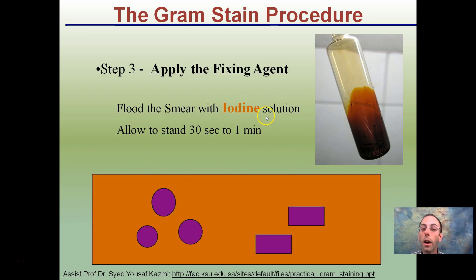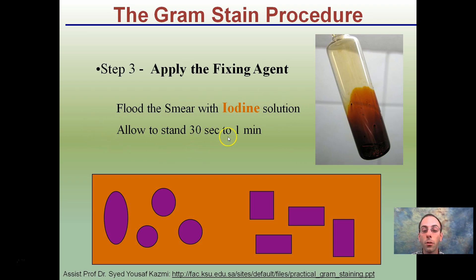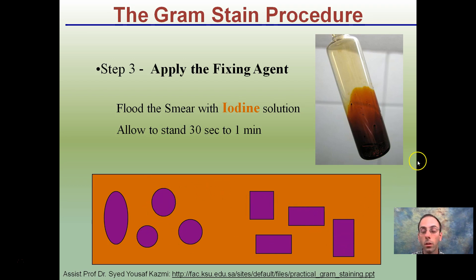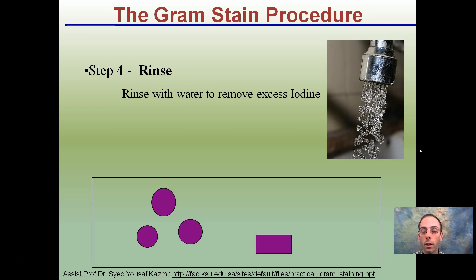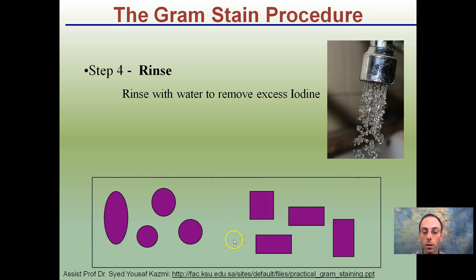Step three: flood the smear with iodine solution and allow that to stand for 30 seconds to a minute. At this point in the gram stain procedure, all of our bacteria are purple. We then rinse off and remove the excessive iodine. Now, after rinsing, we technically have all our cells being purple — but we're not done yet.